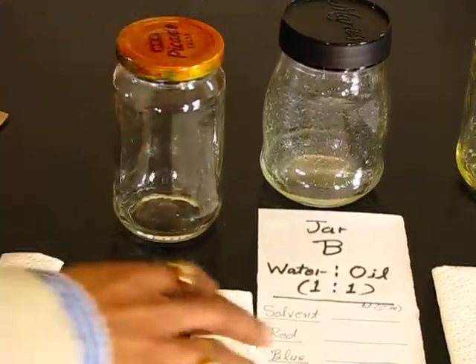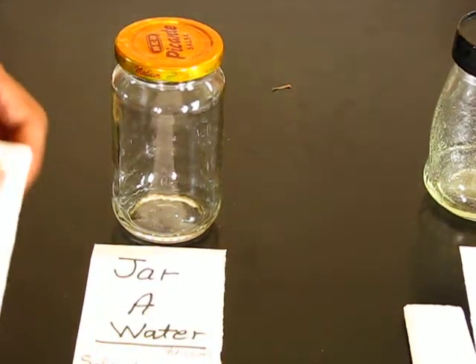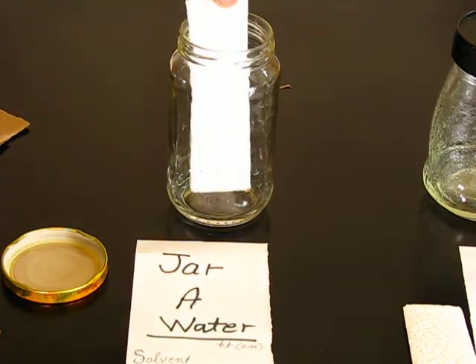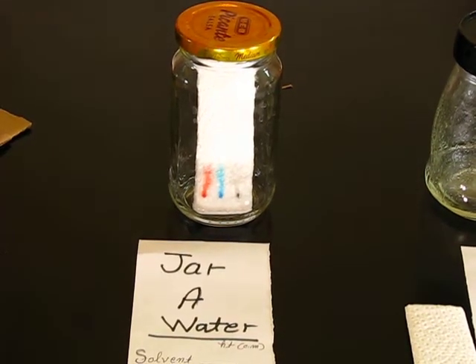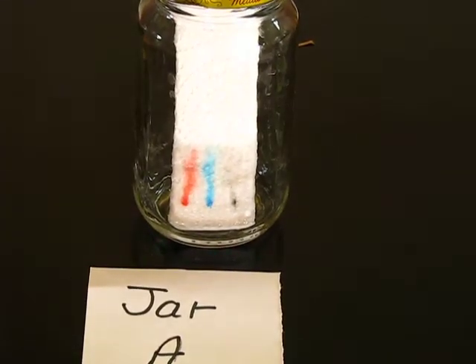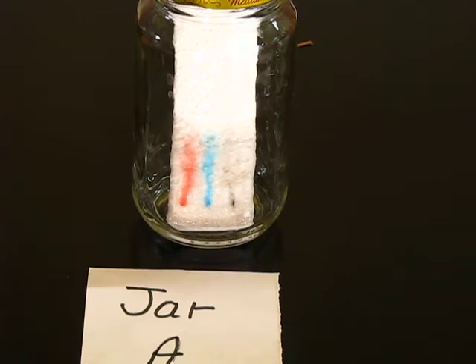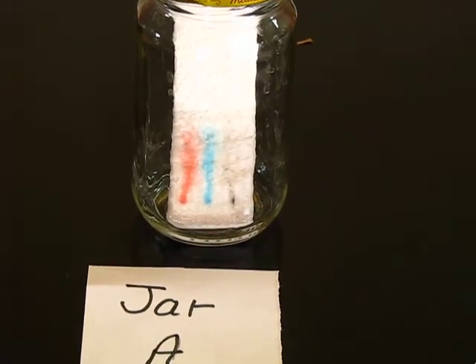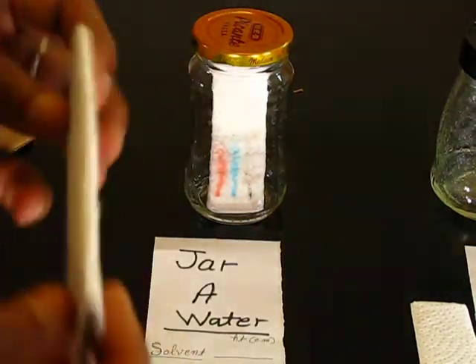I'm running the first TLC in jar number one — 100% water. I place the TLC plate into the jar and you can see the water is moving very fast up the plate. You can see how nicely the color is moving up, and we want to see which color moves and how far. The paper is water-absorbent, and both the blue color and red color are water-soluble, which is why they run well.